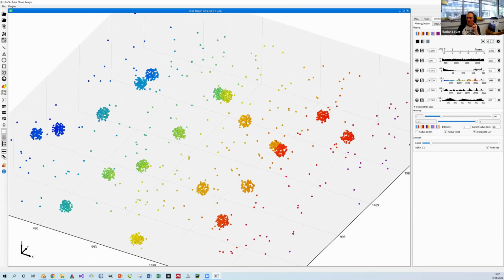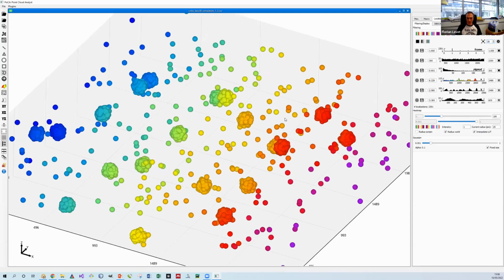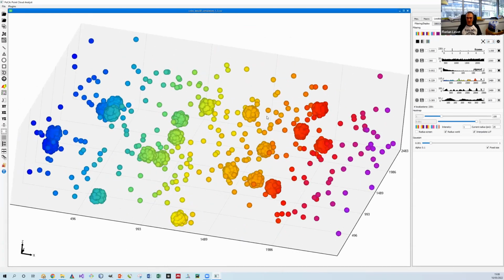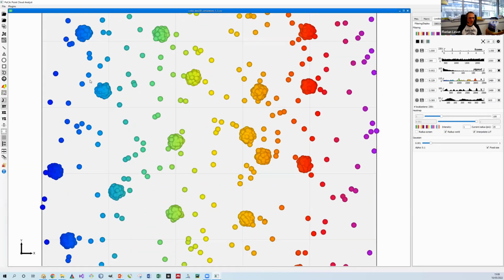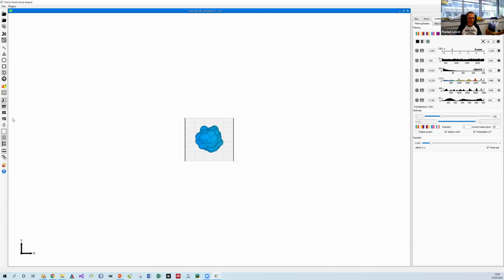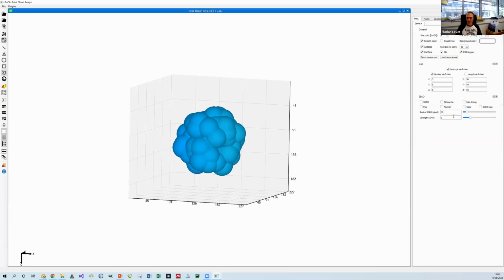So one of the things that is possible in PoCA is that you can play with the size of the localization if you want, do some cropping again in order to go only to one localization, one cluster, sorry. And you can, for instance, if you want, add some screen space ambient occlusion.